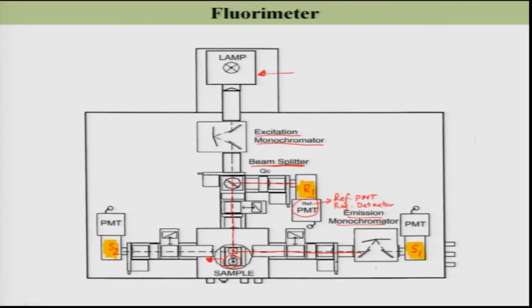Now when you are going to measure the emission, it is also clear at this point that to get the corrected emission spectra you already have generated the correction file, right. You already have generated the correction file, the S lambda file, I just explained. So, you already have this S lambda file for correction.